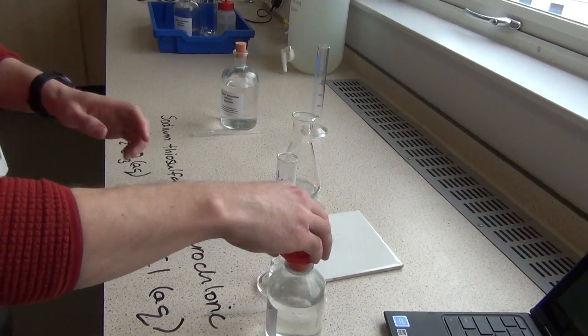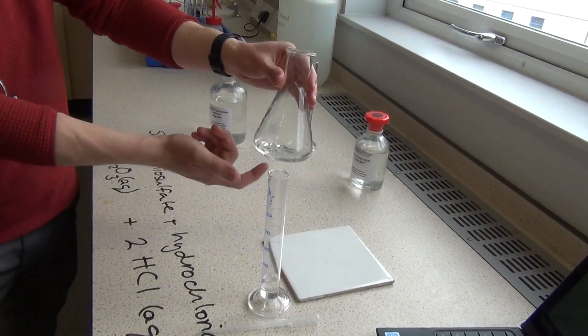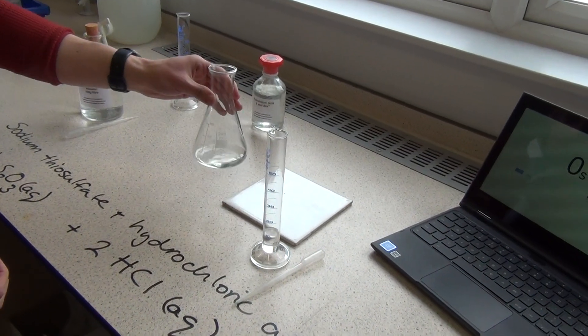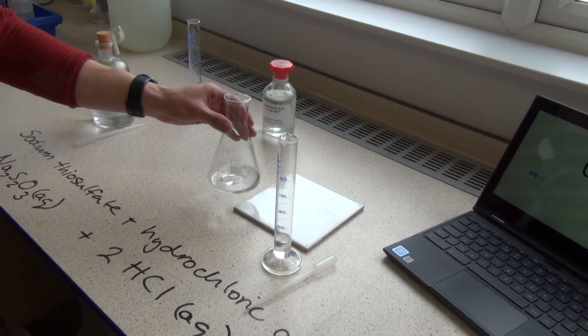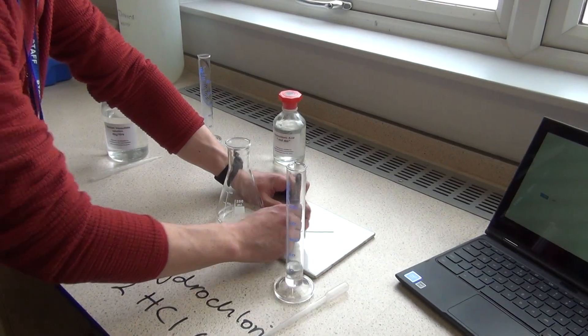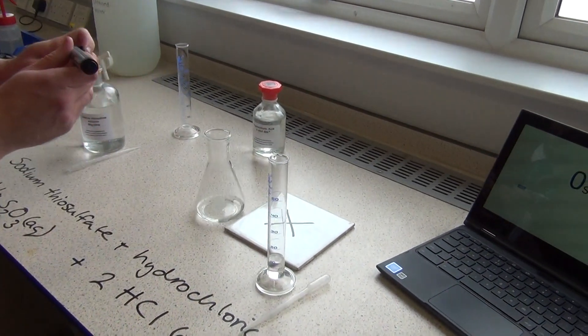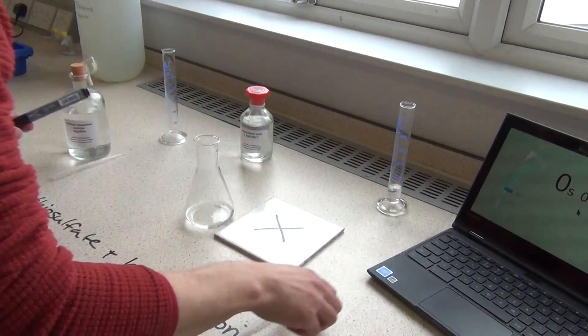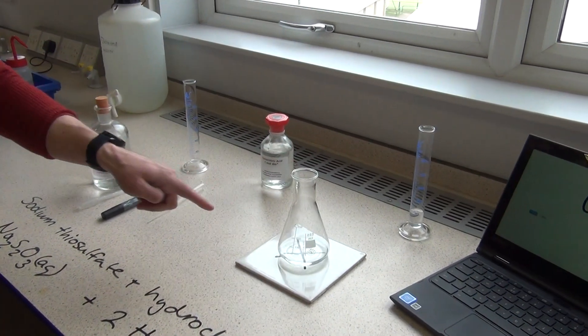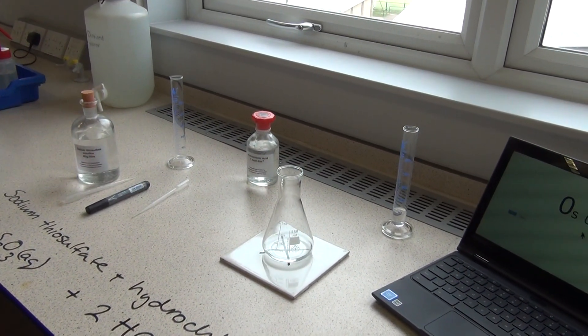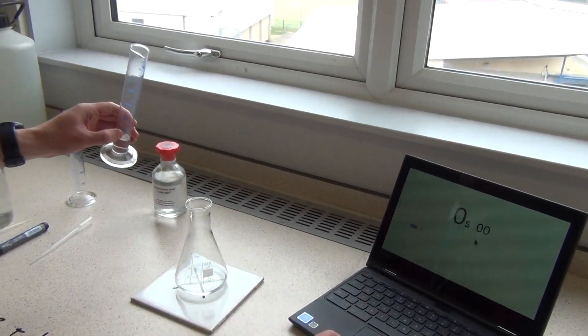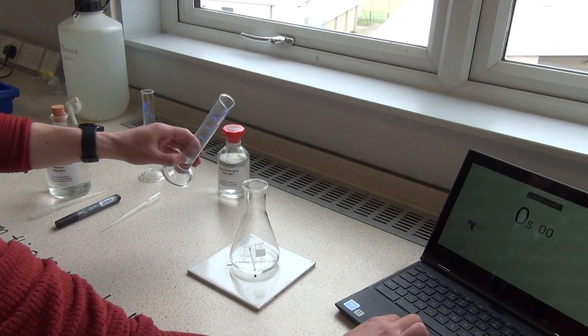Now, as soon as I add the hydrochloric acid to the sodium thiosulfate in here, it's going to start reacting, and what I need to do is time how long it takes to turn cloudy. But cloudy is a bit of a weird judgment, so what we're going to do is we're going to draw a black cross on this white tile, and what we'll do is we'll say that the reaction's finished when I can no longer see that black cross through the solution. Okay, so I'm going to add the hydrochloric acid and start my timer at the same time.